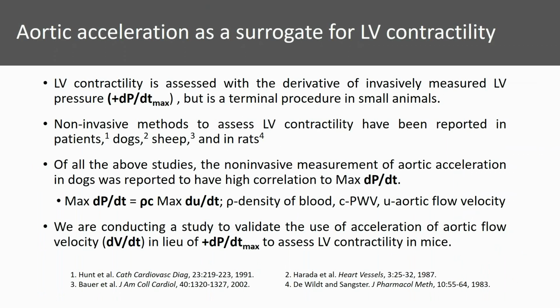I'd now like to call on Dr. Reddy again to jump back in and spend a bit of time discussing some of the recent studies that he's been completing at Baylor. These studies look at aortic acceleration as measured with our Doppler system as a surrogate for left ventricular contractility measured using an invasive pressure catheter.